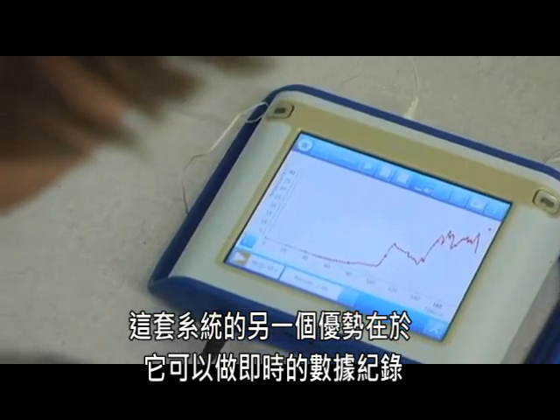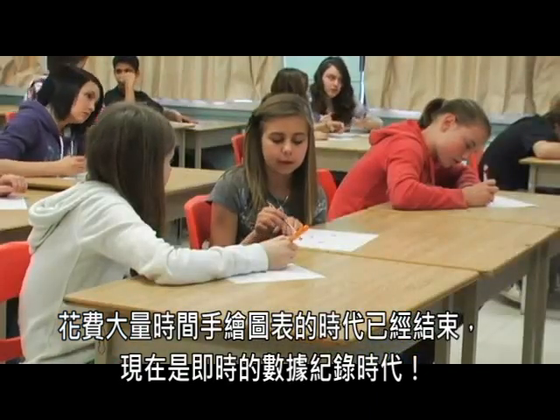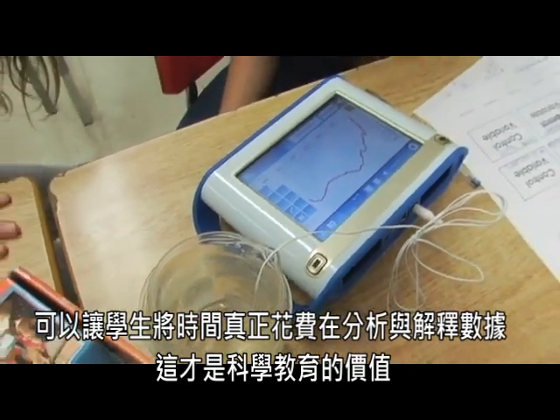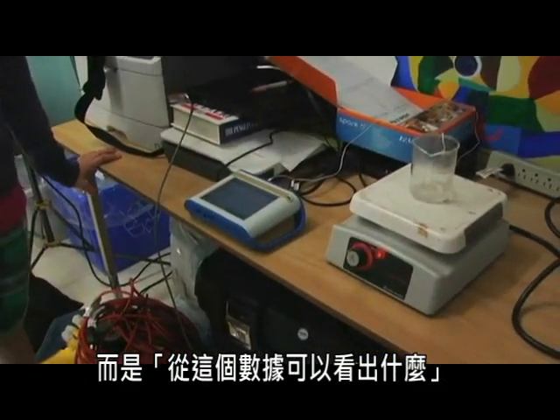The other advantage is it collects the data real time. So gone are the days of spending tons of minutes doing these handmade graphs. They're collecting the data real time, but that gives them then the time to actually analyze and interpret that data, and that's where the real rich learning takes place, not coloring in bar graphs or drawing of a line, but what does that data actually mean?